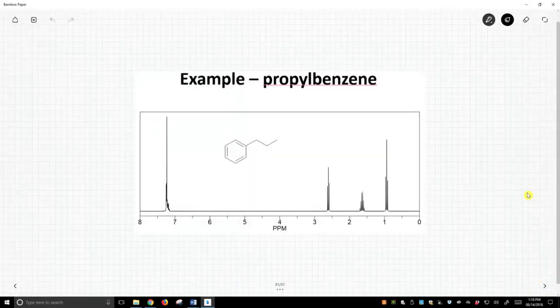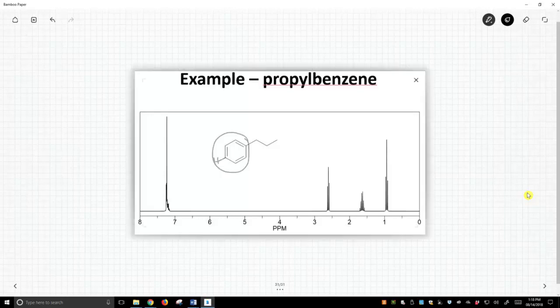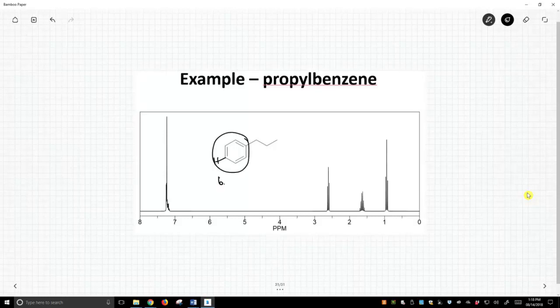Here's propylbenzene. The benzene ring, all of these hydrogens on the benzene ring, they show up in the six and a half to eight window, and they all lump together here. They don't have a distinct multiplicity. Not all hydrogens show pretty multiplicities. But we have this CH3, we have this CH2, we have this CH2.